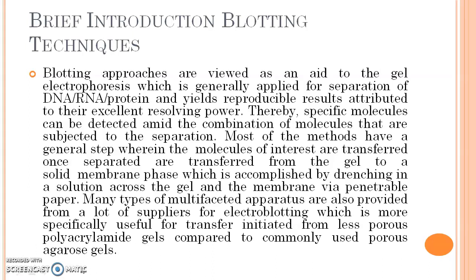Blotting approaches are viewed as an aid to gel electrophoresis, which is generally applied for separation of DNA, RNA, and protein, and yields reproducible results attributed to its excellent resolving power. Thereby, specific molecules can be detected amid the combination of molecules subjected to this separation. Most methods have a general step wherein the molecules of interest, once separated, are transferred from the gel to a solid membrane phase, which is accomplished by drenching a solution across the gel and the membrane via blotting paper.